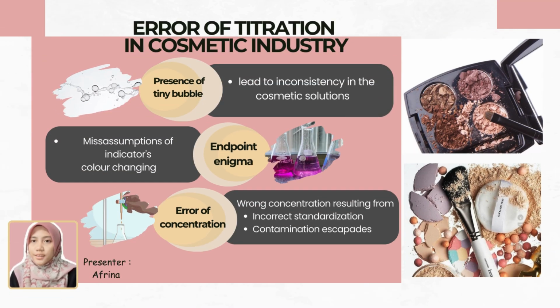Next, the errors of titration in the cosmetic industry. Is there any possibility that errors can occur in titration? The answer is yes. One of the main errors is the presence of tiny gas bubbles in the cosmetic formulation, which affect the consistency of the cosmetic solution. Next, endpoint error.